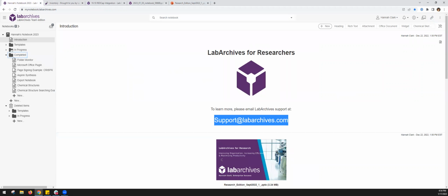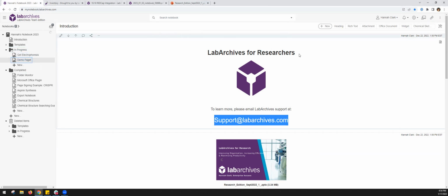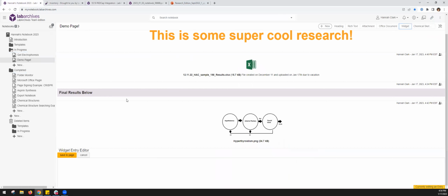Anna, can you show the widget for the freezer boxes? That's very useful, I think. Oh, yeah. Not too frequently used these days. Yeah, so we do have a freezer box widget. I'll go and grab that.